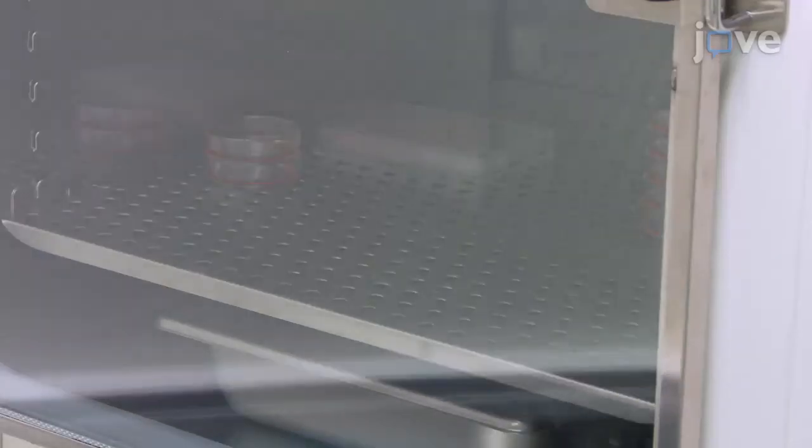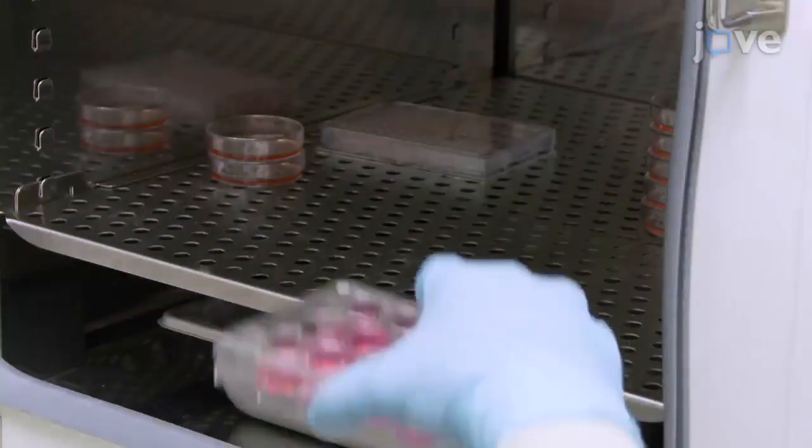Also, it is recommended to always use an upstream regulator of the hippo pathway, such as MST, as a positive control when performing the luciferase assay. After this, return the cells to the incubator.